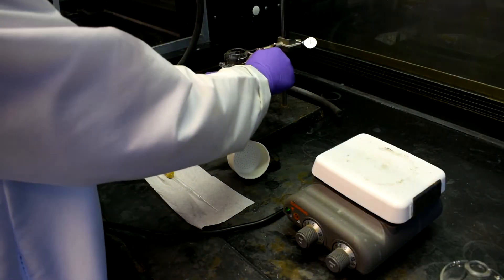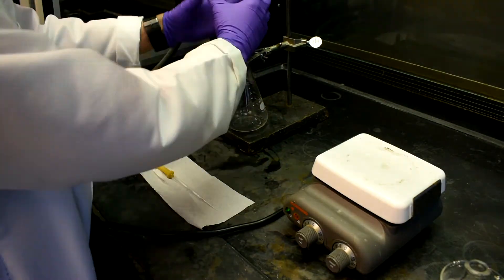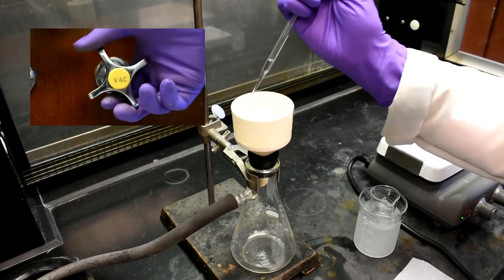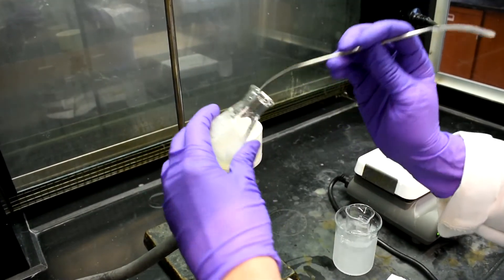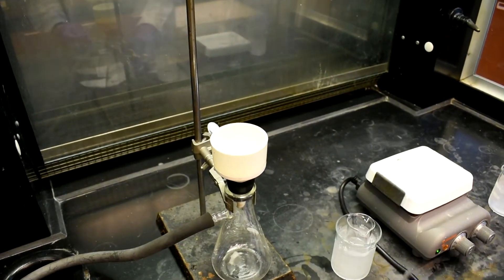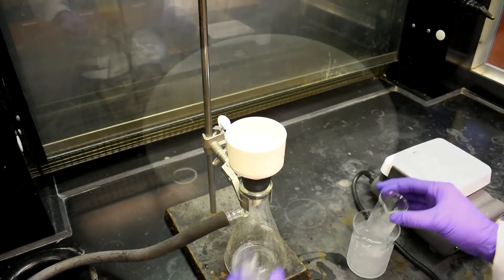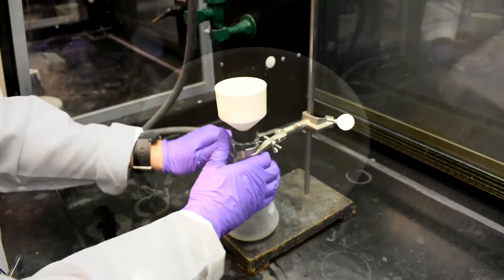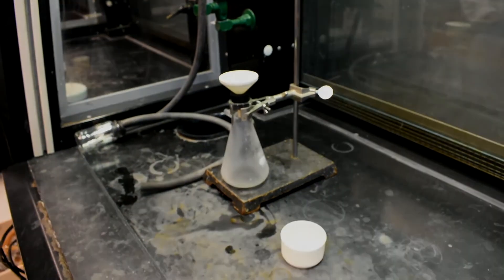After recrystallization, another vacuum filtration will be performed to isolate the crystals. Assemble another vacuum filtration apparatus. Wet the filter paper with some ice-cold methanol and turn on the vacuum. Use a spatula to transfer the crystals to the Büchner funnel. Use ice-cold methanol to wash the Erlenmeyer flask and retrieve any remaining solid, then wash the crystals with ice-cold methanol. Remove the vacuum trap prior to turning off the vacuum, and allow the crystals to dry until the next lab period.